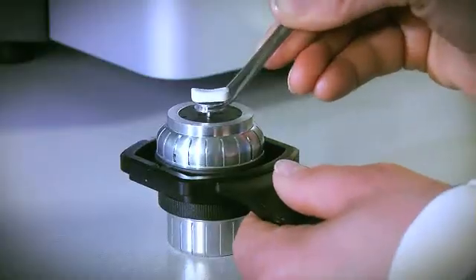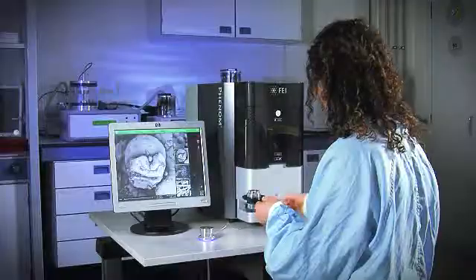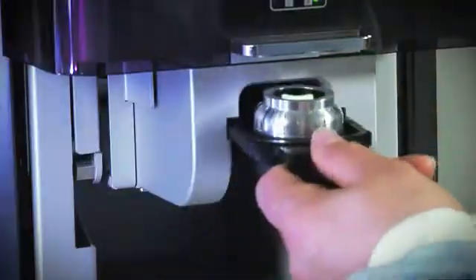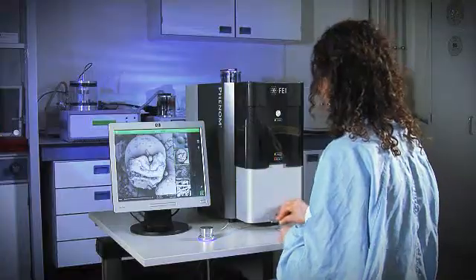Mounting samples is simple and instant, requiring no special tooling or adjustment. Insert the sample holder and close the door.